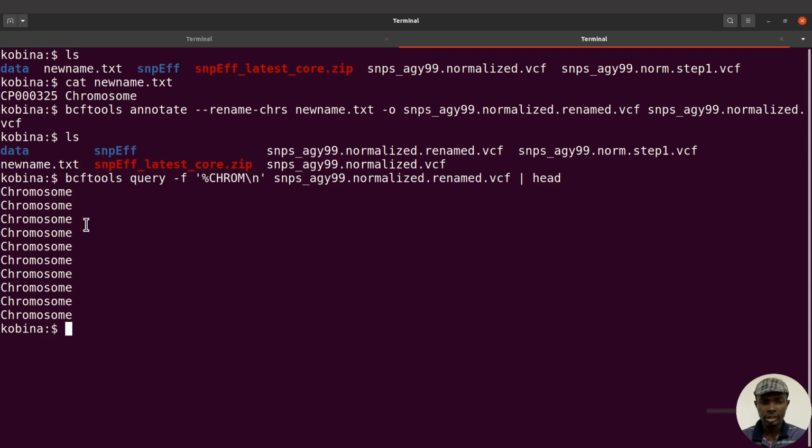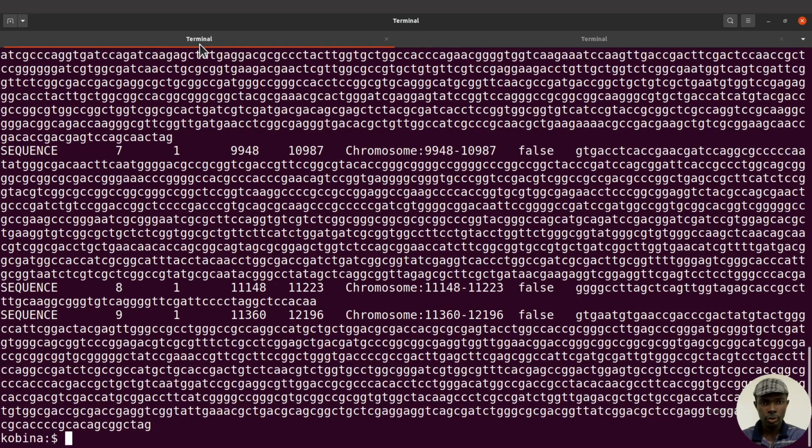Okay, so it's the same format. So take note of that. All right. So now we have this one. So this one matches what is here. All right. So now we can rerun snpEff, and then we are sure to get what we want.